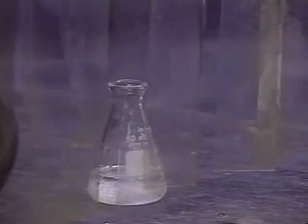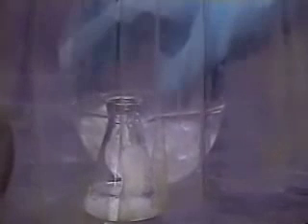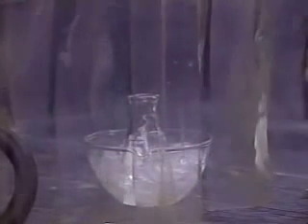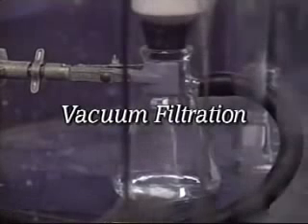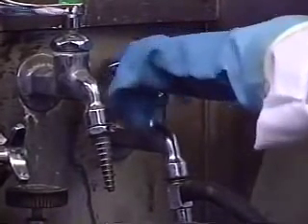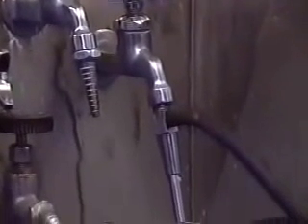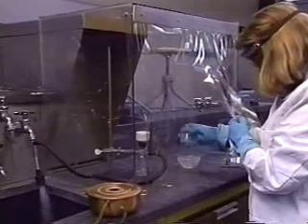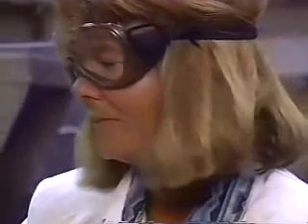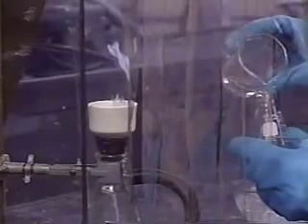When crystal growth is no longer apparent at room temperature, place the flask in an ice bath for an additional 10 minutes. Turn on the water aspirator. Rapidly pour the mixture through the funnel. Rinse the flask with a small amount of cold solvent.